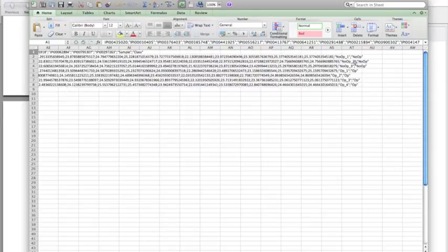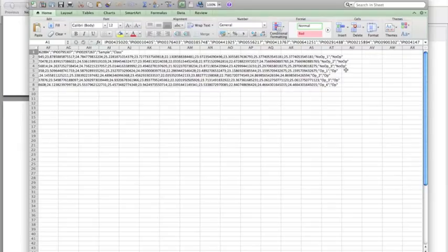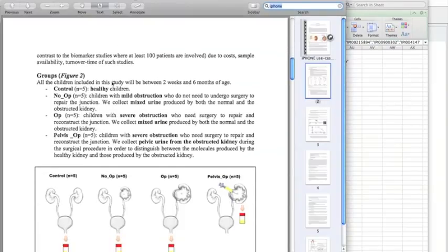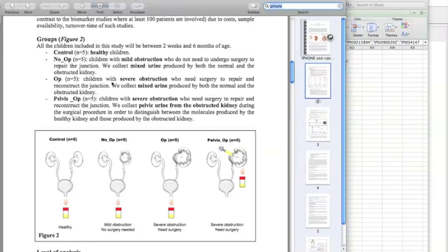data mining to get some predictions for these proteins, and then to finish this off we want to actually connect the outcome of the data mining to data in the CUP knowledge base and try and see if we can put any of those proteins back into the context of where they might be expressed in the kidney.